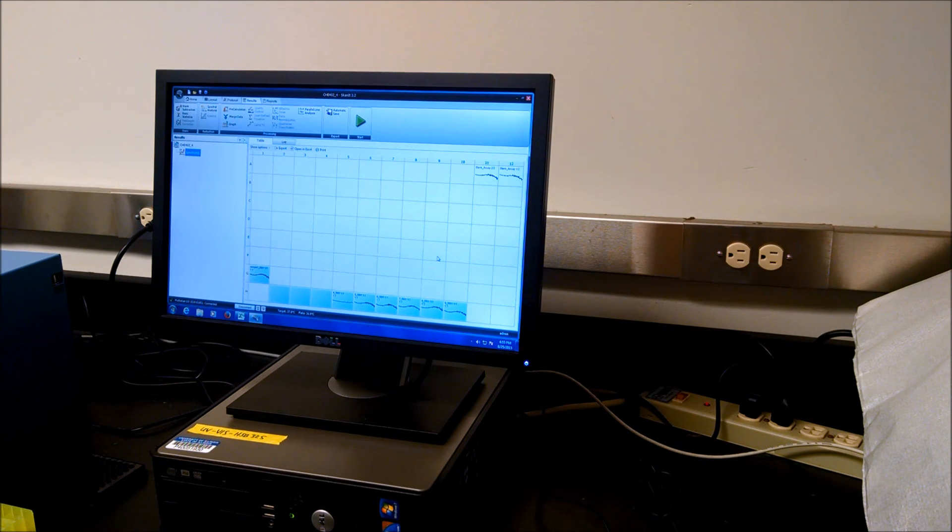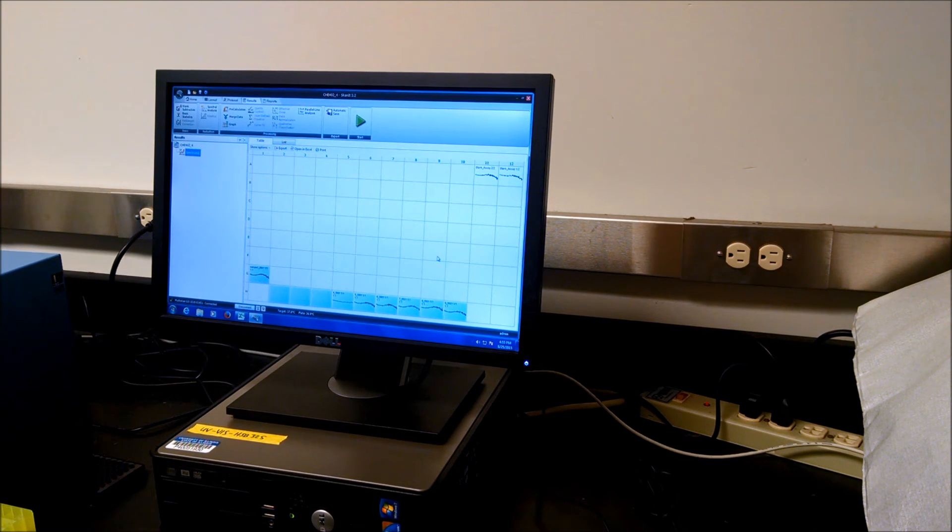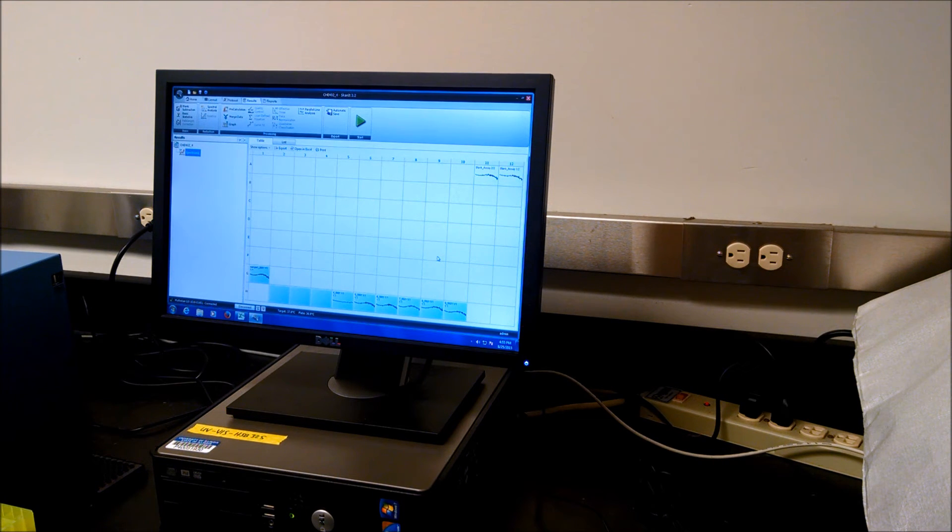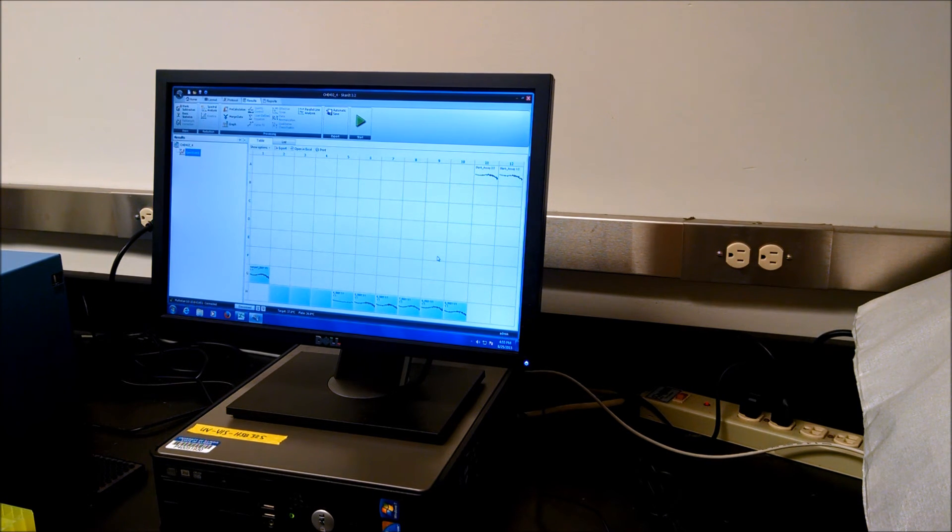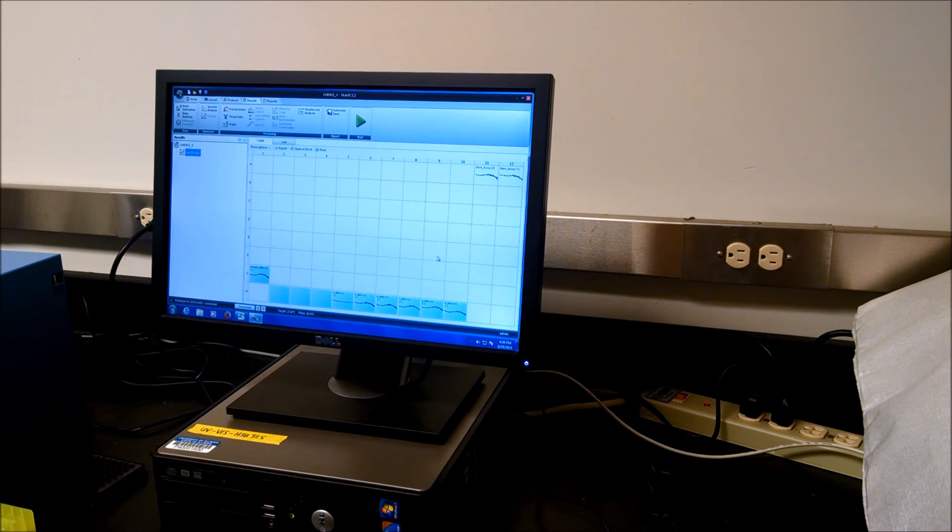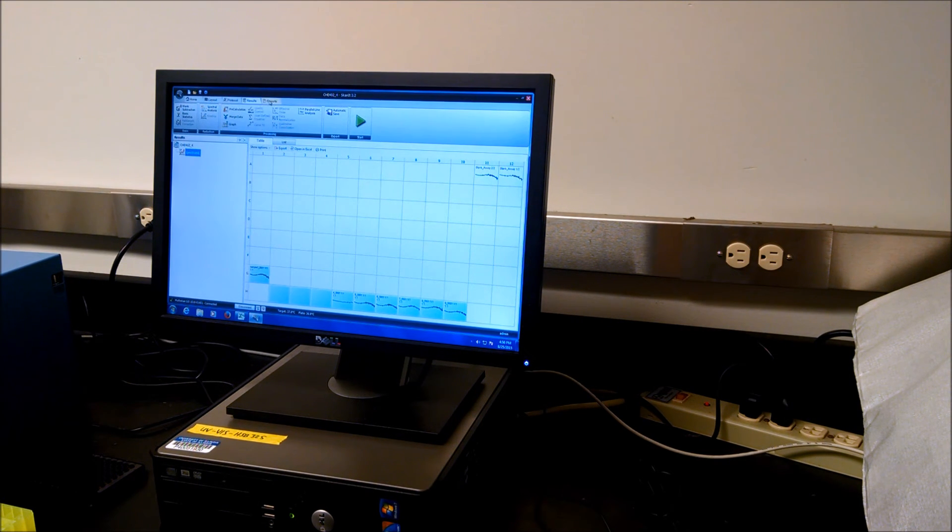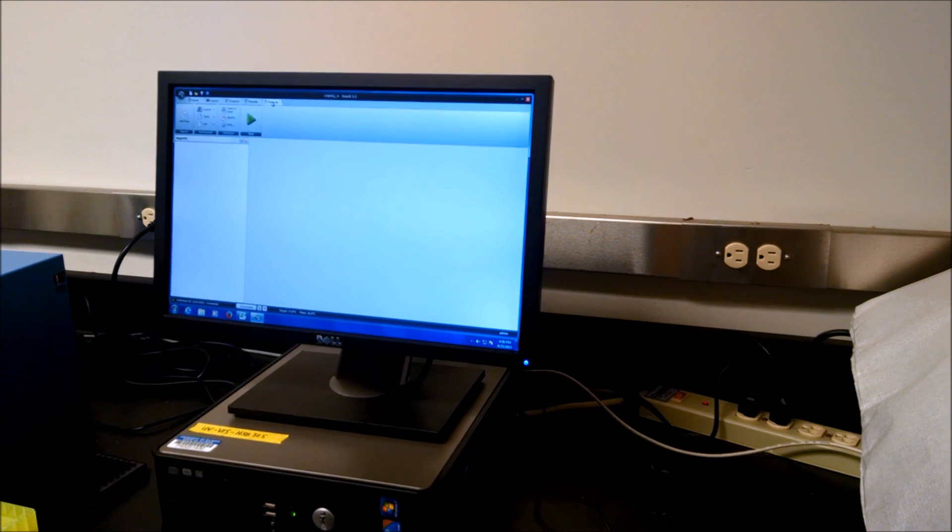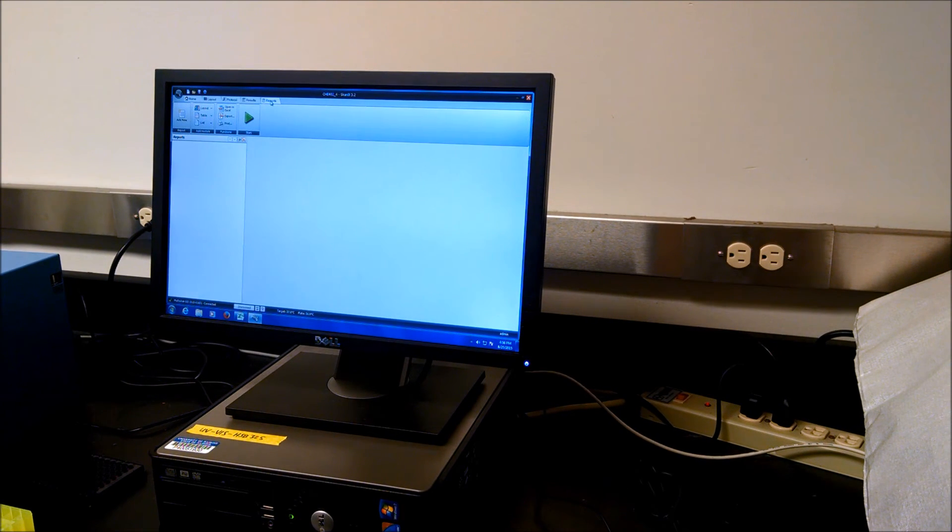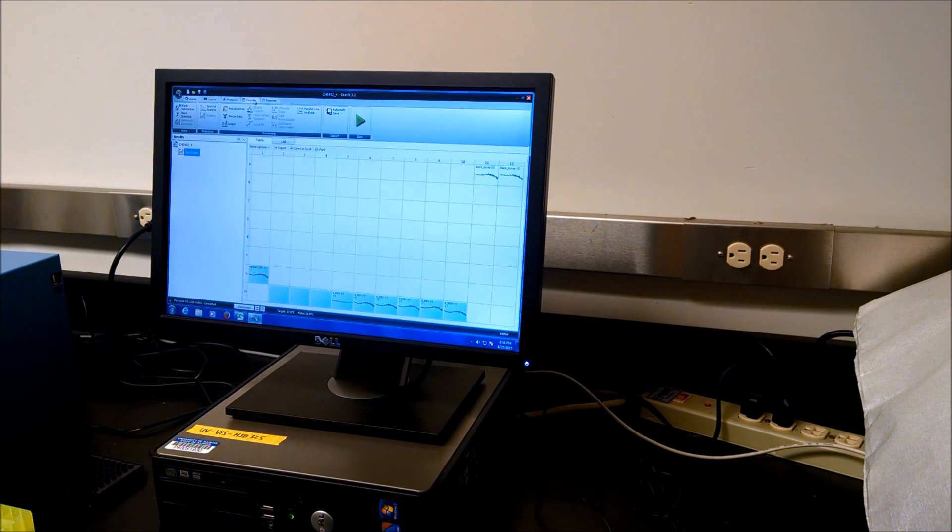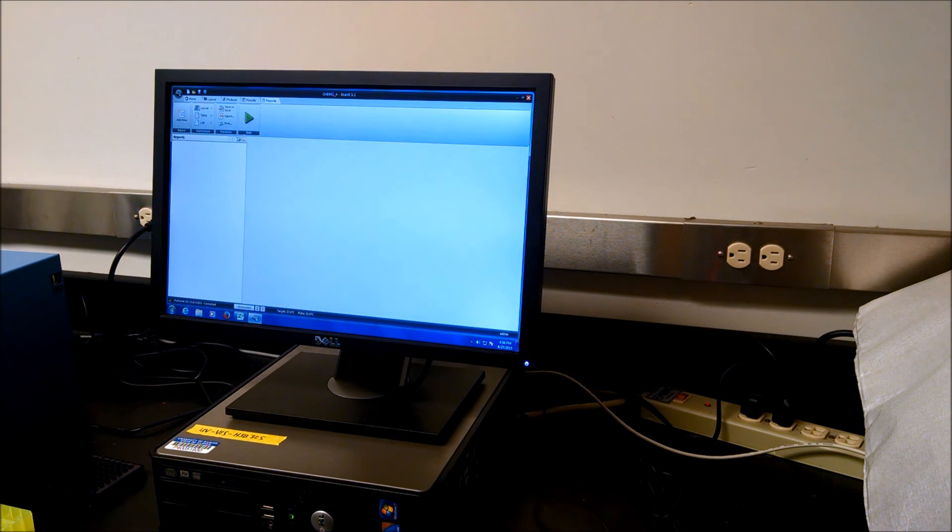The plate reader opened so we can put away our 96 well plate and start another sample. For example, you want to save your results.